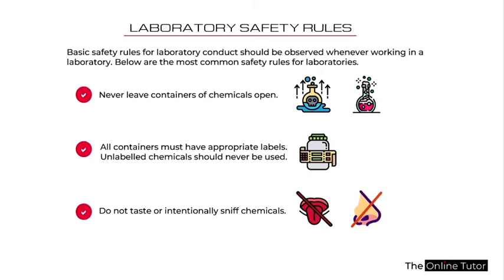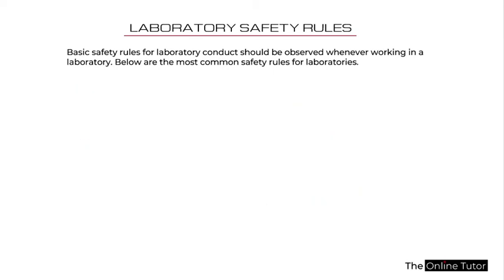Now, do not taste or intentionally sniff any chemical. We said previously that you should assume all chemicals in the laboratory are highly toxic. So there's no way you should try to taste or sniff any chemicals. It's not good for you. There are a lot of potential hazards that can accompany sniffing or tasting any chemical in the laboratory, so try to avoid doing that.